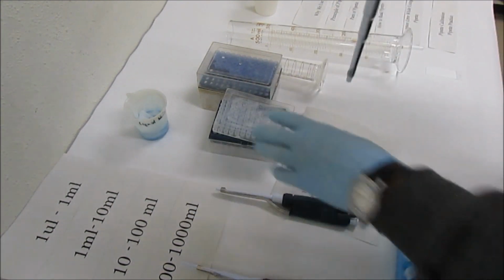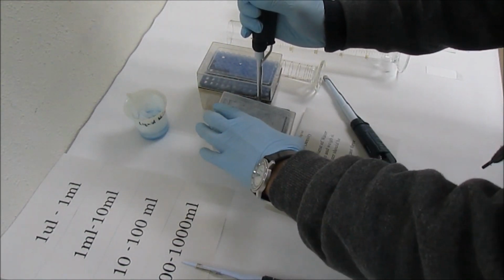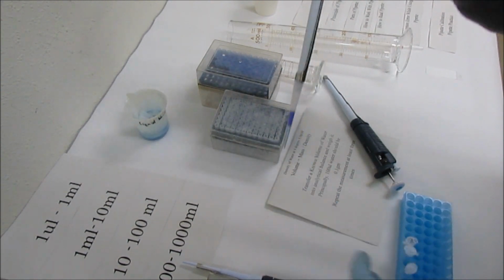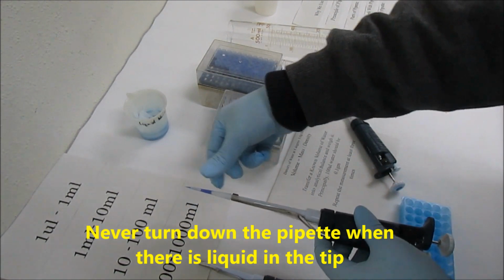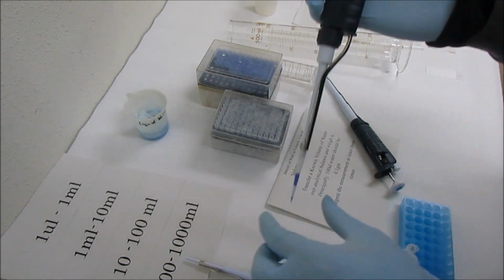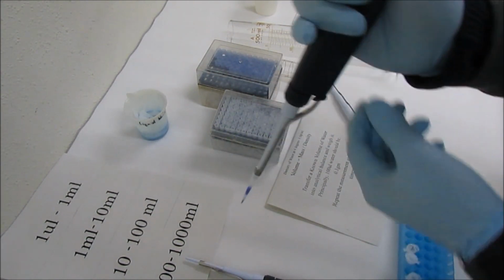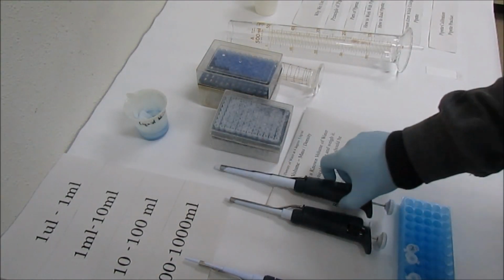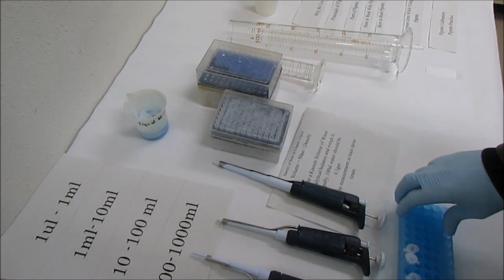If you have liquid in the tip, you never need to put the pipette down like this, otherwise the liquid will go inside and damage the internal machinery. So be careful. Whenever there is liquid in the tip, never put it down like this. Always keep it upright, vertically. So these are the 4 important tips that you always have to take care of.